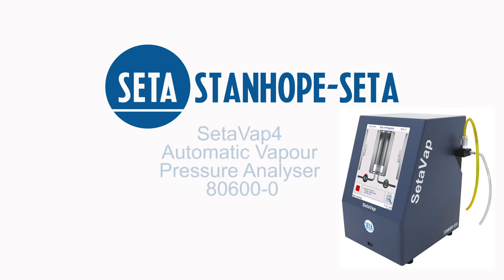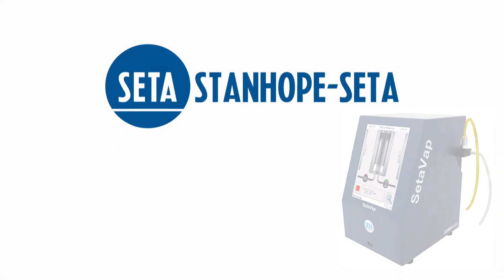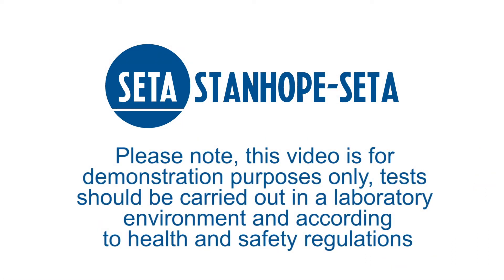In this video we will demonstrate how to verify the performance of your SetaVap4 80600-0 in accordance with ASTM D5191. Please note this video is for demonstration purposes only. Tests should be carried out in a laboratory environment and according to health and safety regulations.